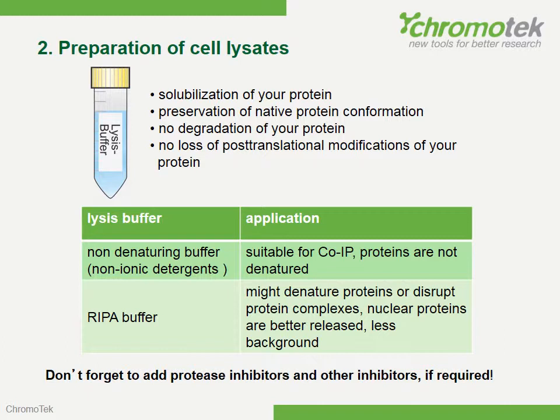To solubilize these proteins, you can use RIPA buffer. However, RIPA buffer is slightly denaturing and you might have problems with co-IPs. And again, please don't forget to add protease inhibitor or other inhibitors like phosphatase inhibitors if you are interested in such modifications.